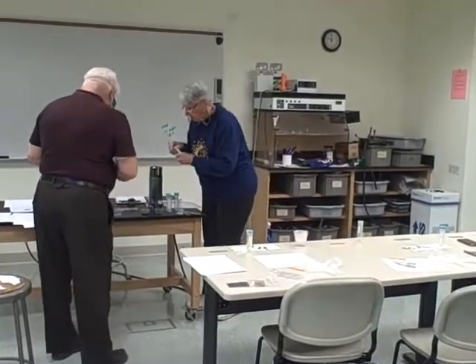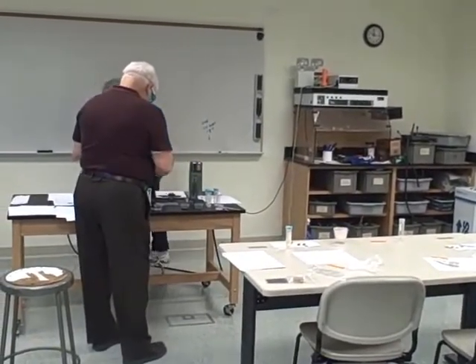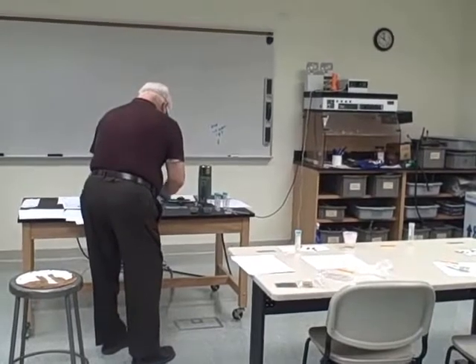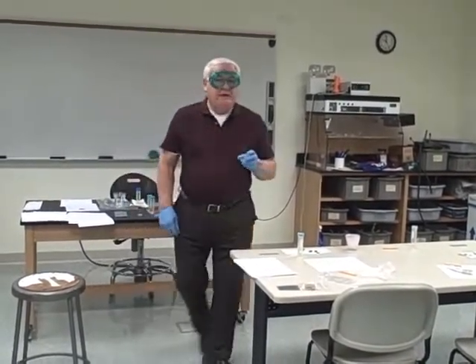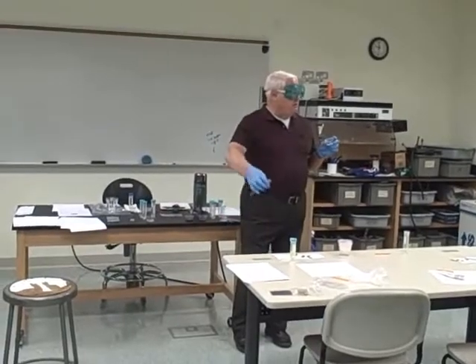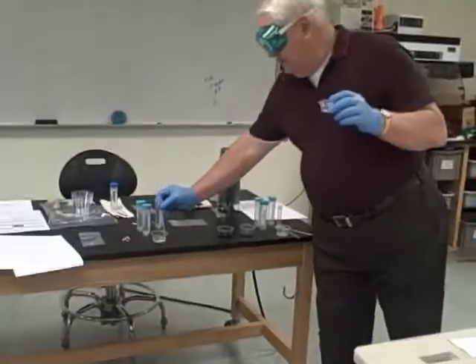We have some calcium beads, calcium turnings, I guess I should say. And we're going to check them in the presence of water and see what kind of reaction that we get. Now here again, we ask that the demonstrator's table be somewhere in the middle of the room where the students can watch what's going on. So this is going to get interesting.